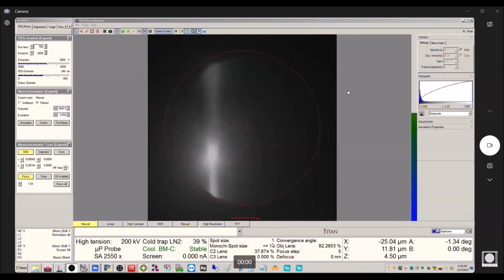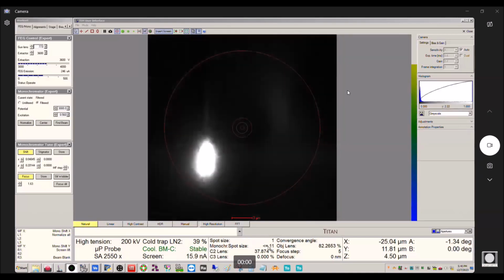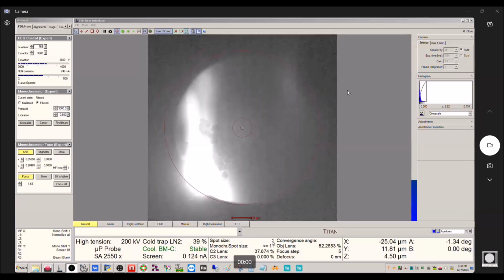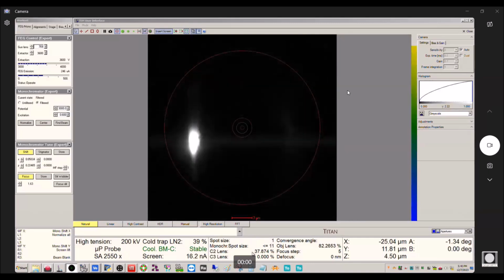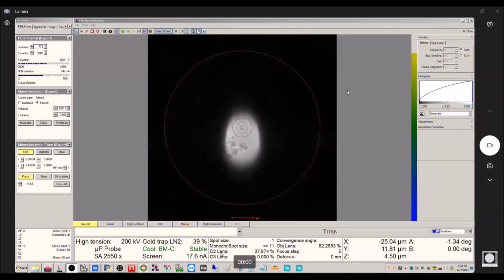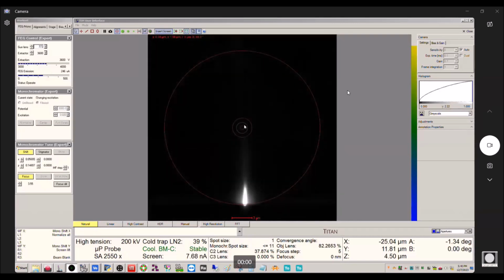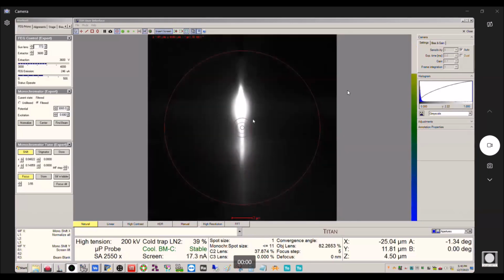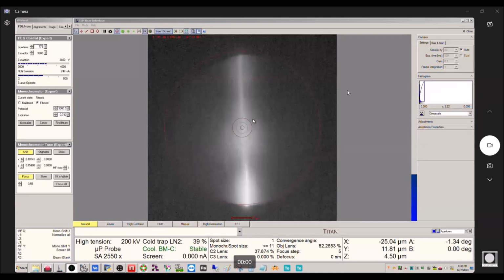The spot size that you use for this is also irrelevant. That's the preconditions it had with spot 1, but you don't have to do this at spot size 1. You could do this at another spot size. It doesn't matter. And as long as you're properly focused with C2, then there's no issue, right? You can see the spreading of the beam now really very distinctly. Okay, we're almost there.